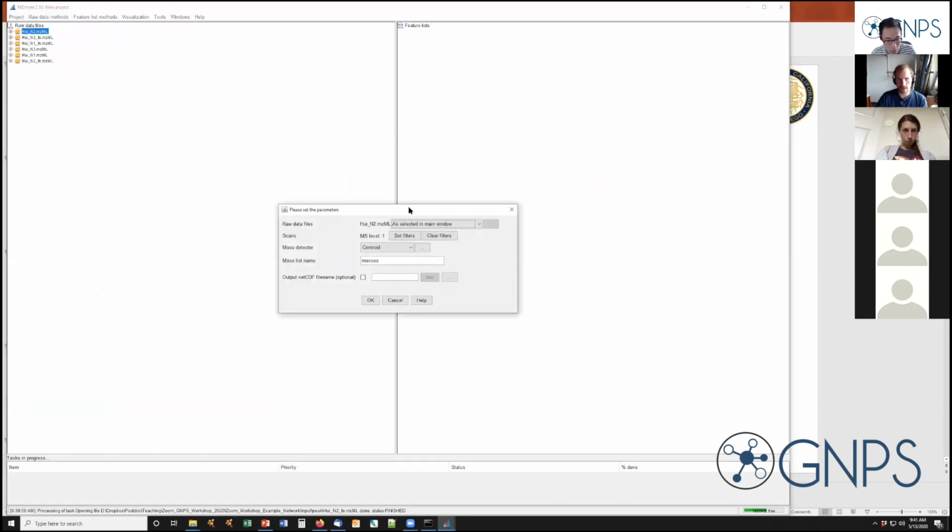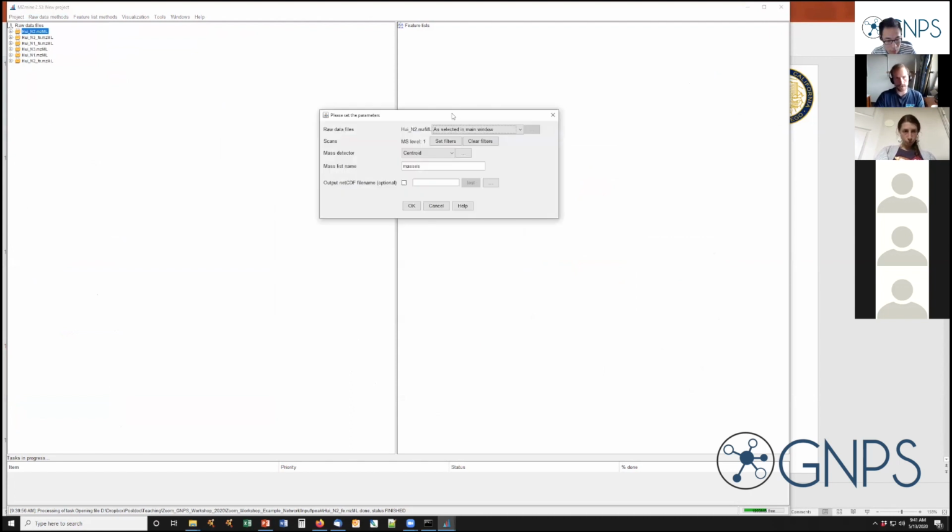And that's actually already a very crucial setting, because if you set that threshold too low, then your data will be full of noise and it's going to take really long because there's a lot of information. And if you set it too high, then you eventually will miss half of your features or the really interesting stuff, which is more low abundant. And this setting is also hard to predict because it depends on your vendor platform.